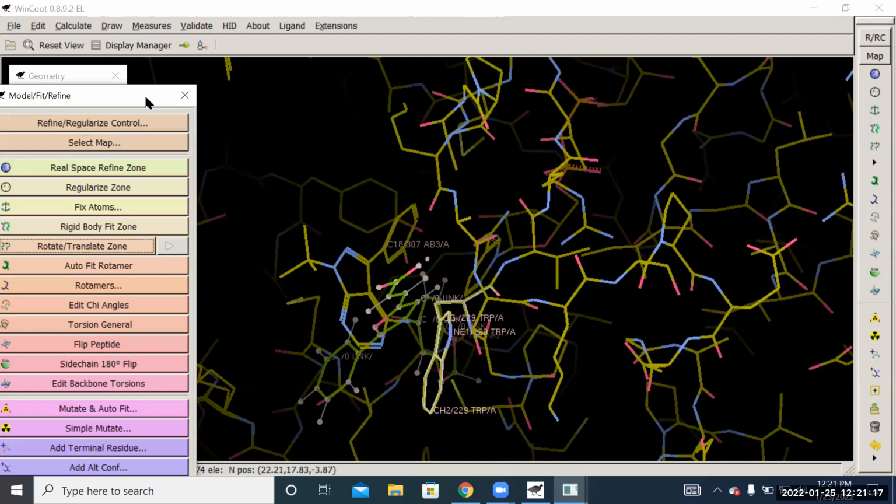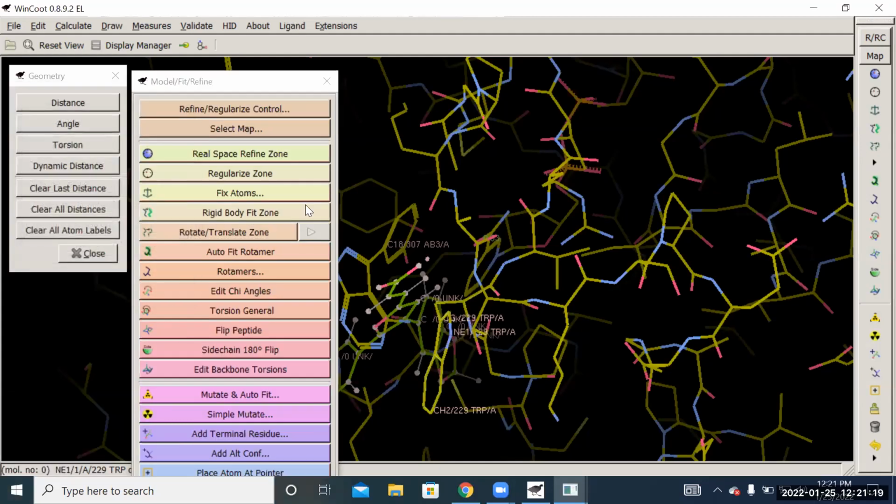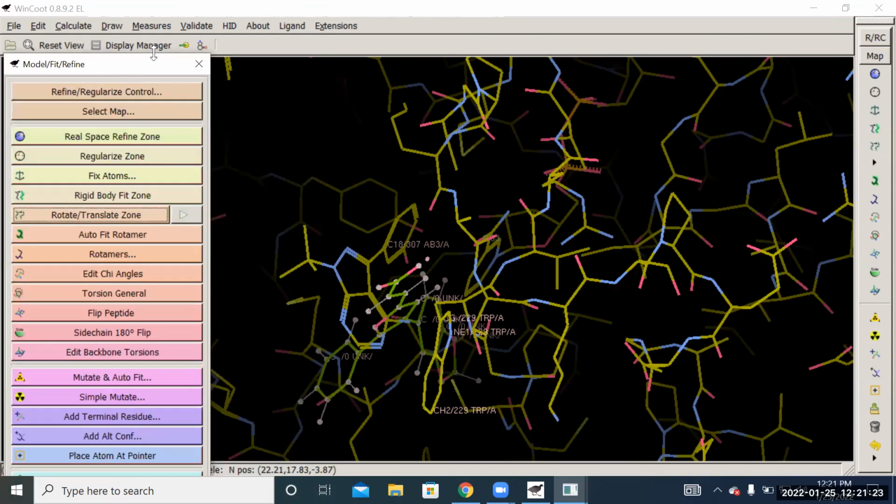And then when you save coordinates, put down what the file name is and also where you saved it. So keep track in your notebook, that kind of stuff. You should have your notebook out, writing notes down as you go on how you did this, okay? All your steps. It is research. It does belong in a notebook, and some kind of notes on what you're doing. It turns out to be important. So you can kind of think of this like an experiment.